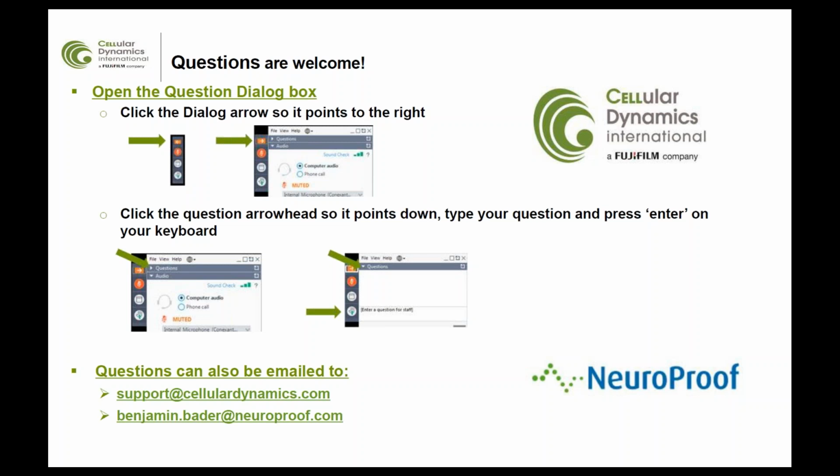Yes and no. So the technology in general can be used, and there the Axion system is actually quite nice to use because we can stimulate electrodes electrically. And we have used that with at least primary neurons with lots of interesting results on a plasticity panel, so that we can see an increase of responsiveness to stimulation by compounds, for instance.